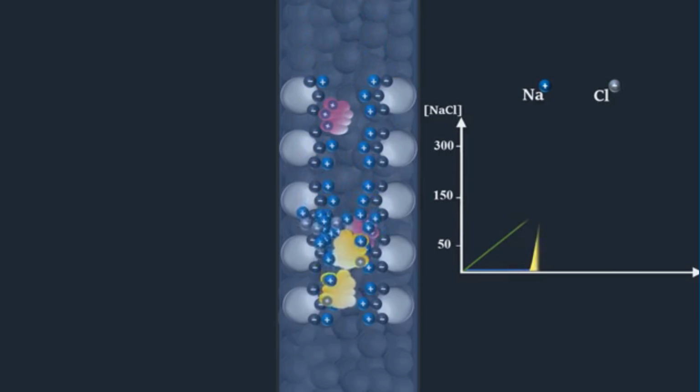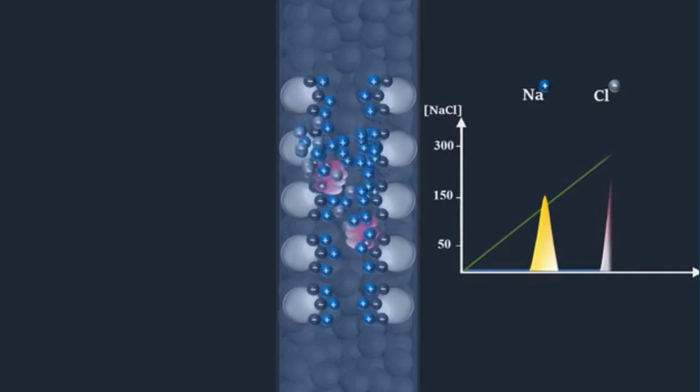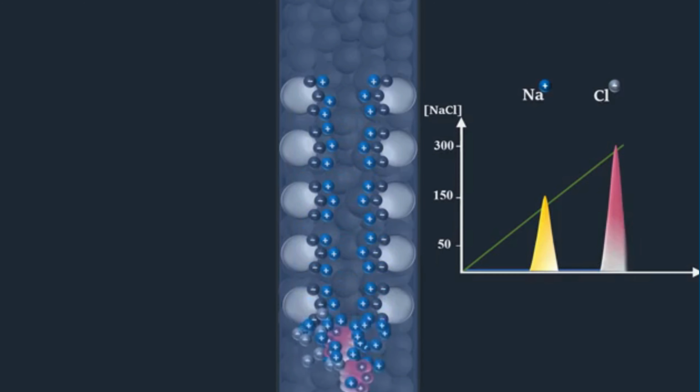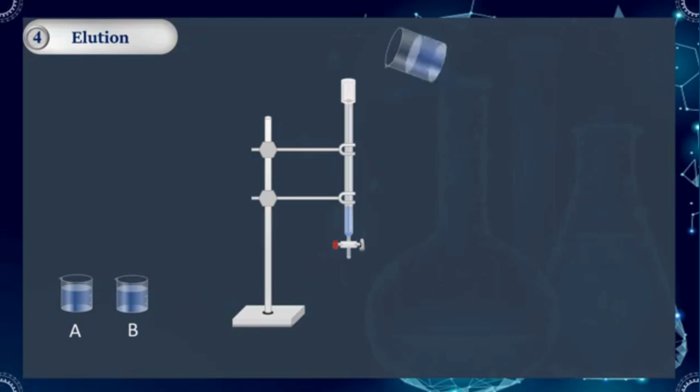Typical symptoms are increasing back pressure, longer rinse requirements, altered breakthrough curves, declining capacity, changes in selectivity, and deterioration of effluent or chromatographic peak quality. Fouling control should begin with pre-treatment, rather than aggressive cleaning after the resin has already been damaged. Filtration, clarification, activated carbon treatment, and appropriate pH adjustment can substantially reduce the contaminant burden.